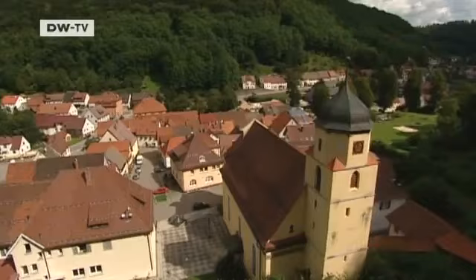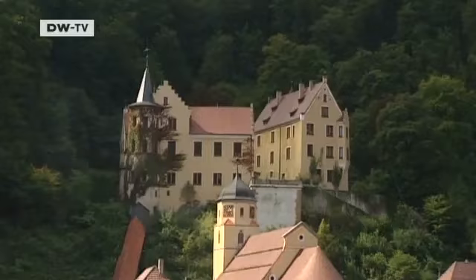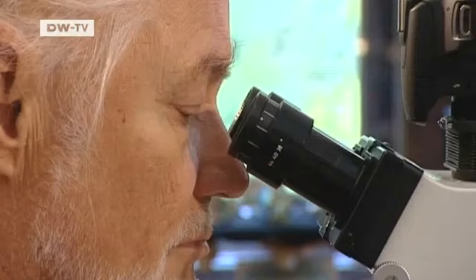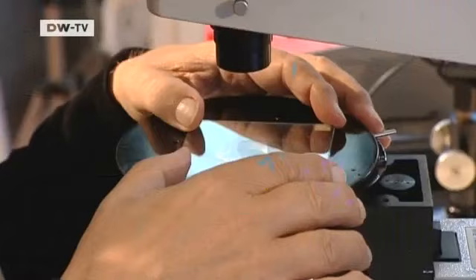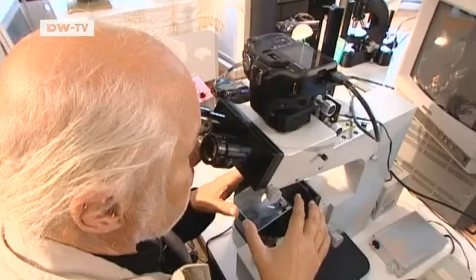At the Schloss Weissenstein Castle in southern Germany, Kage founded the Institute for Scientific Photography and Cinematography in 1959. His goal was to study microscopic images. Looking through a microscope, if you've set it up well, is like opening a door and entering a parallel world. A world that doesn't at all correspond to day-to-day happenings. And this parallel world presents these tremendous organisms that represent diversity and a peculiar life that you normally would never be able to imagine.